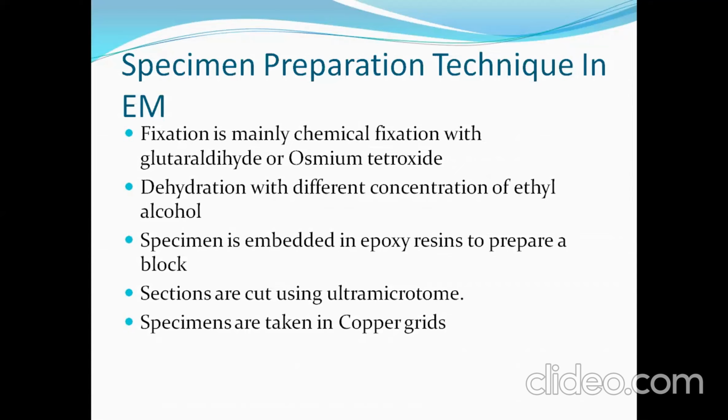And if we are using certain plant materials or animal materials and we want to dehydrate the material, another step is incorporated before staining, that is the dehydration step. There also we are using different grades of alcohol to dehydrate the material, then finally staining, and finally observation. So these are the normal steps which we follow when we prepare samples with the light microscope.